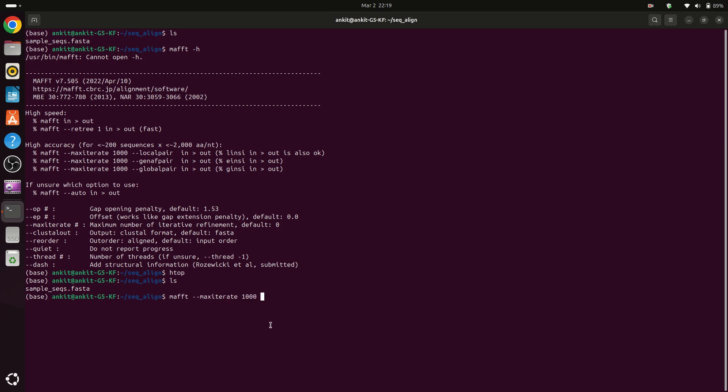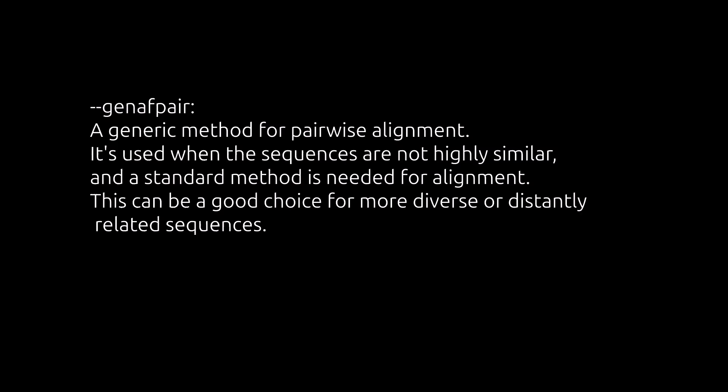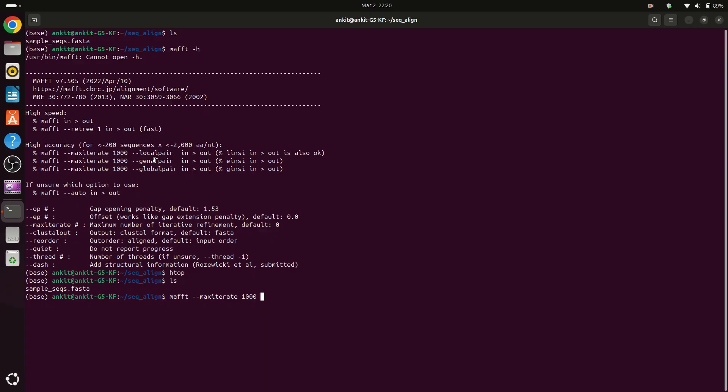Then we have to provide one more input which is localpair or globalpair. I don't know what it is but mostly we use localpair or globalpair.